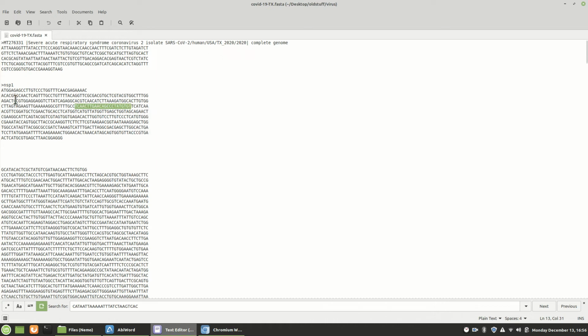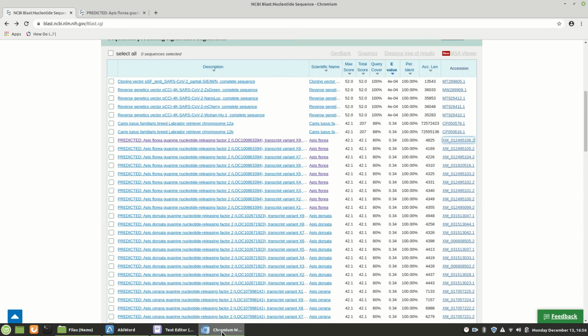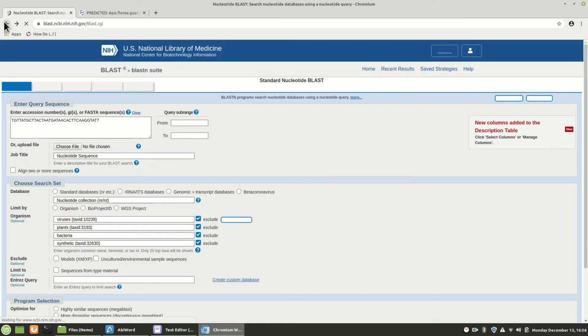So you should probably take 2 or 3 here in the early part, but grab 10 across the sequence. Any 10, they do not have to overlap. In fact, probably shouldn't. And so just go through and grab some smaller sequences and run them just like we did here. So I'm going to run another one.